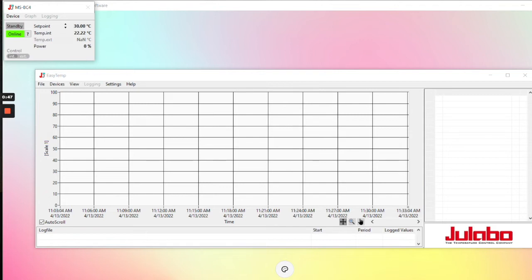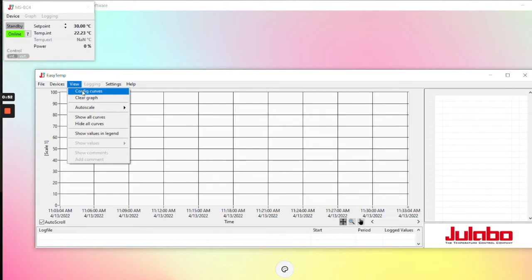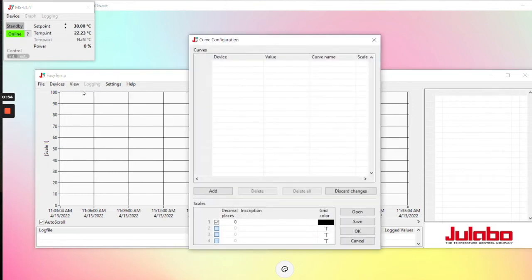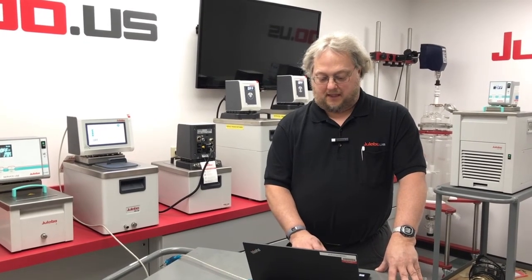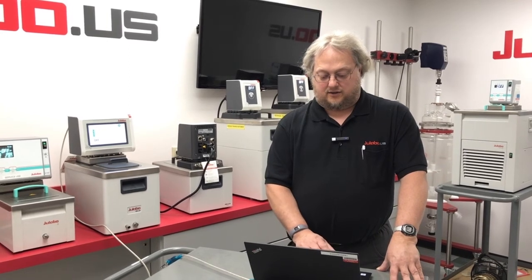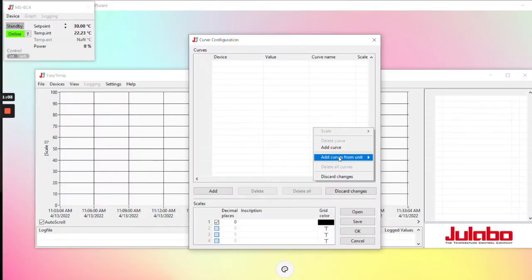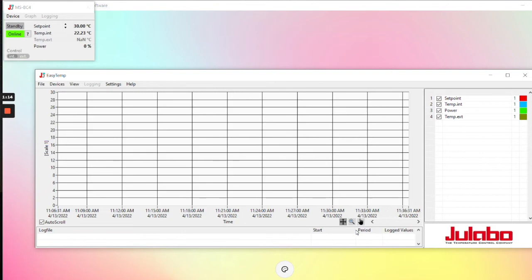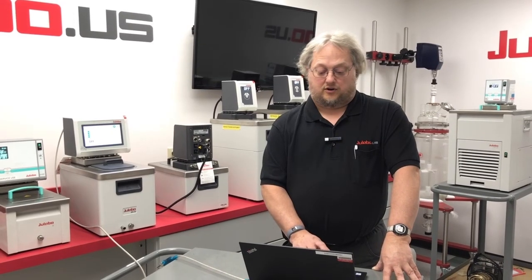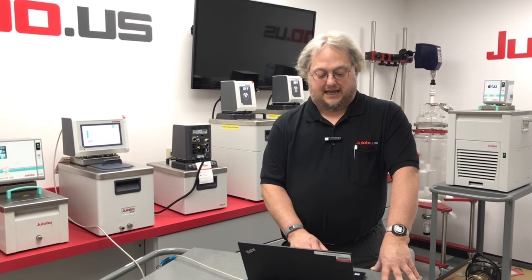It opens up the device window. In order to graph, you need to configure the curves. Go under View, then Config Curves. Right-click on the window that pops up, and there's an option Add Curves from Unit — it will bring all of the possible curves up in that window. Then you can go to File, New, and Start Logging to log your data if you wish.